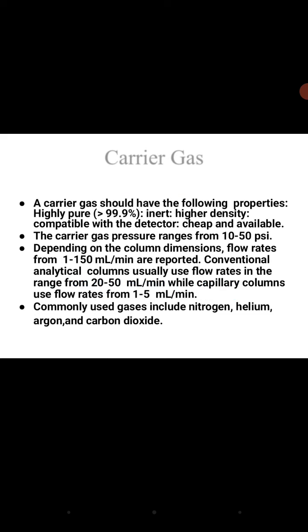Conventional analytical columns usually use flow rates in the range from 20 to 50 milliliter per minute, while capillary columns use flow rates from 1 to 5 milliliter per minute. Commonly used gases include nitrogen, helium, argon, and carbon dioxide.